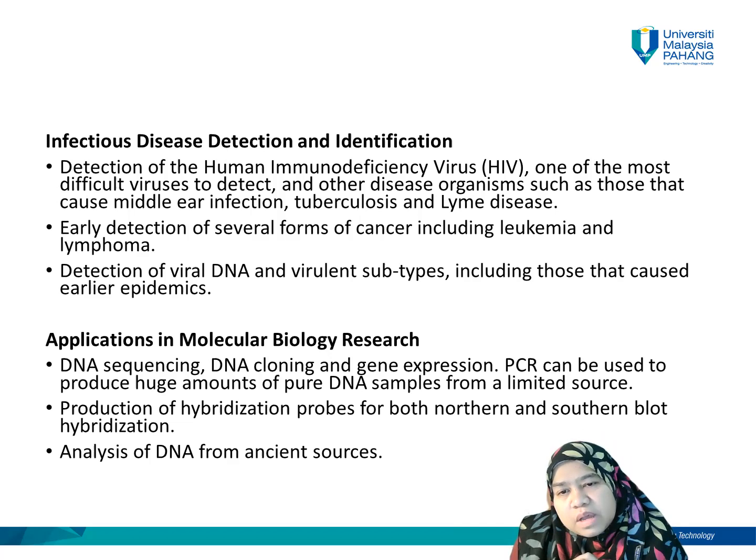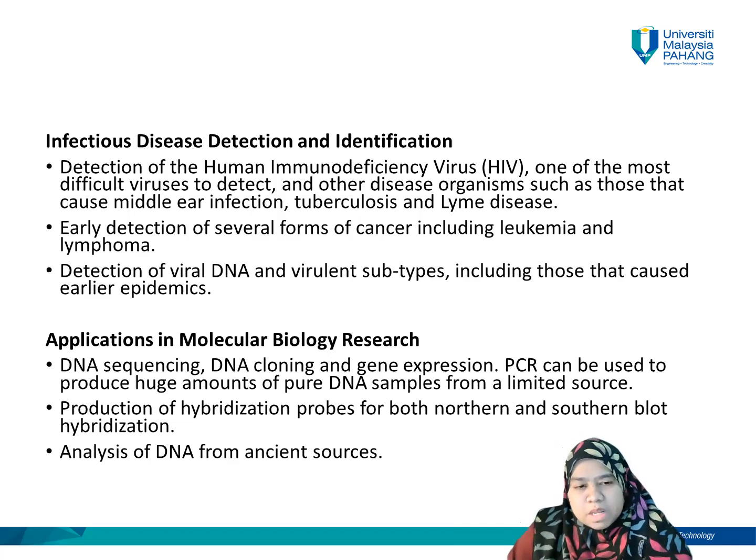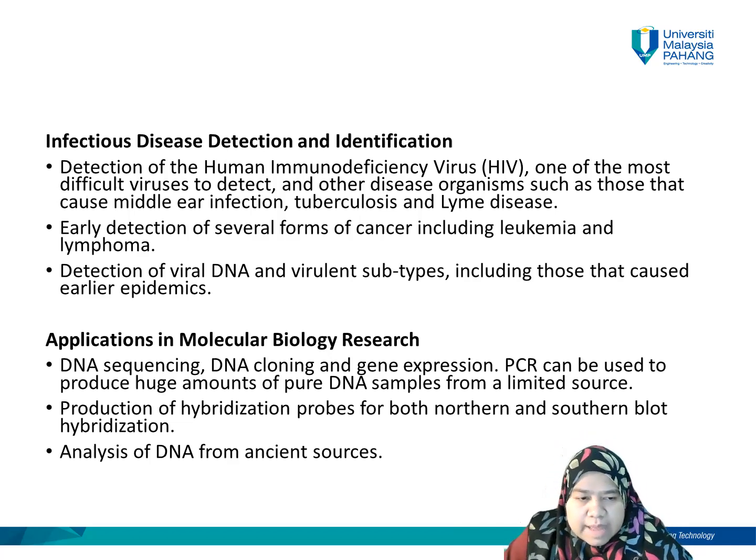Application in molecular biology research: DNA sequencing, DNA cloning, and gene expression, all these involve PCR in the process of gathering the DNA for analysis. PCR can be used to produce a huge amount of pure DNA sample from a limited source. Production of hybridization probes for both northern and southern hybridization. Analysis of DNA from ancient sources.